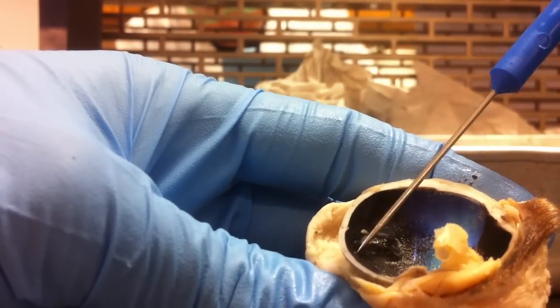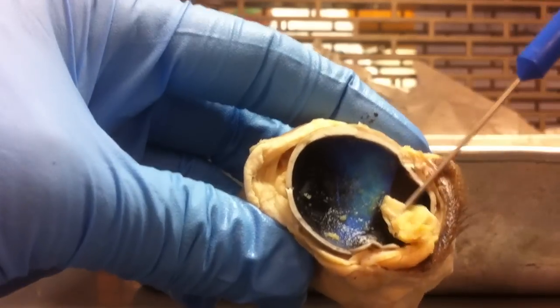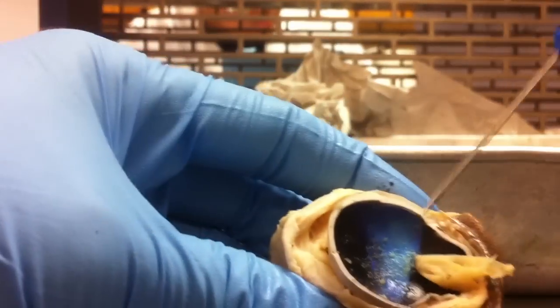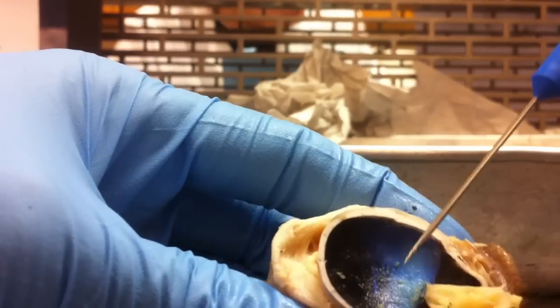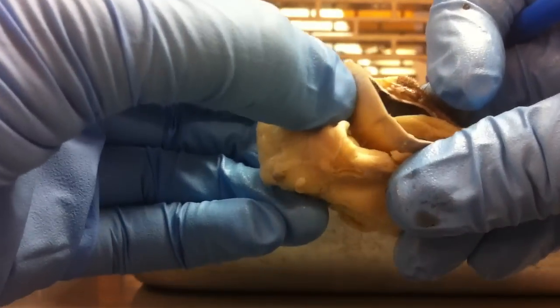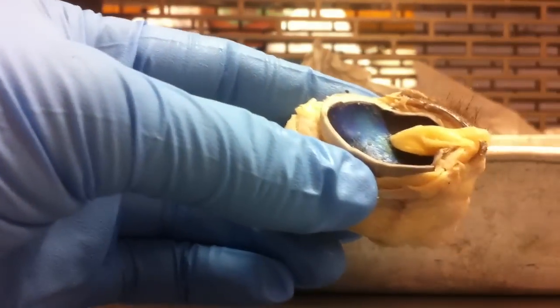Behind that is your choroid coat, which is the black part, and your tapetum lucidum, which is the bluish coloring right here. And your sclera.